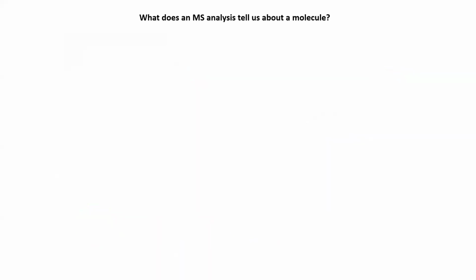But now, who can answer this? What can an MS analysis tell us about a single molecule? What can we learn about the molecule? If you don't know what you are infusing, what can we learn from an MS analysis? The weight, the molecular weight. And what does it tell us? We are just putting this molecule's m/z on a balance, and we know the weight. So what are we learning about that molecule? Great. The formula.